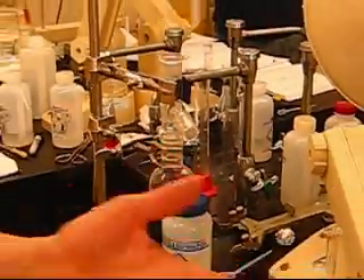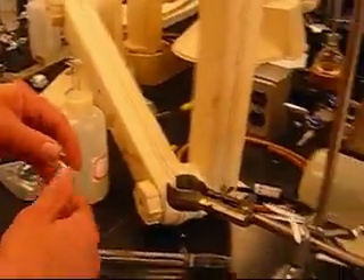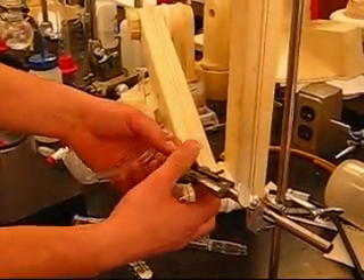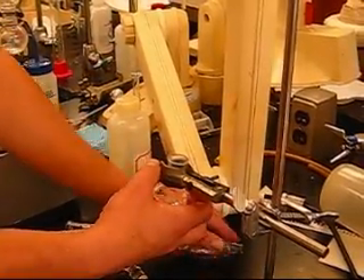On this side, this is where we're catching the distillation. To do that, we bring up this device right here and close the clamp.